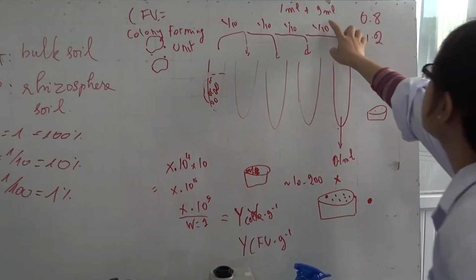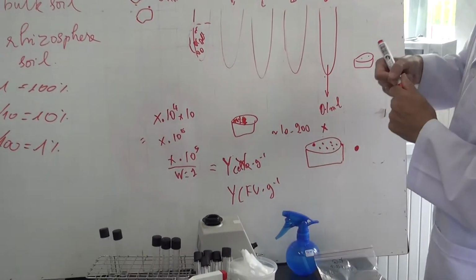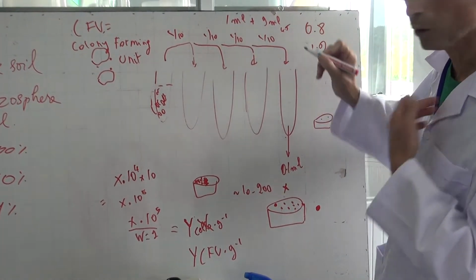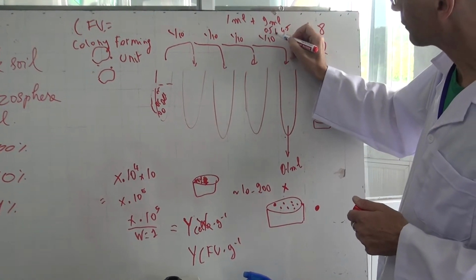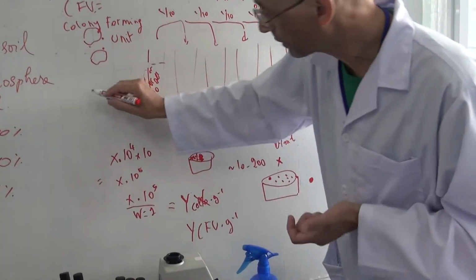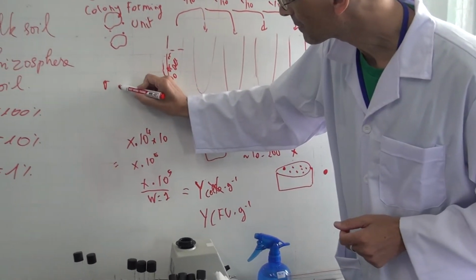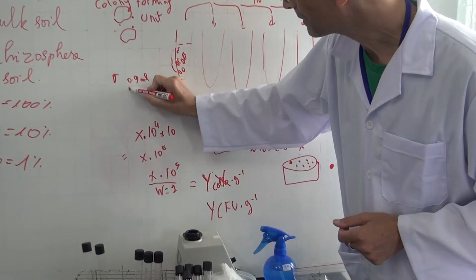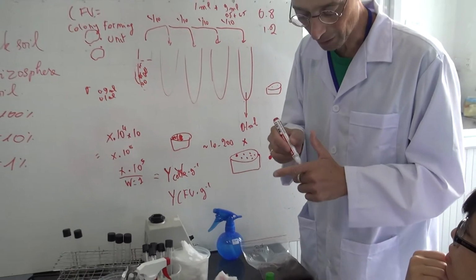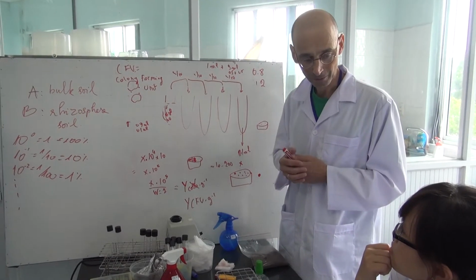Yeah? Yes. If it's not 9, it's 5. Okay, you can do whatever you want. If instead of 9, we often use 0.5 and 4.5 because then it's smaller. You can also, depends, sometimes we do in Eppendorf, small tubes. So we take 0.9 milliliter and 0.1 milliliter, it depends on the habit of your lab and how you're doing it, what is more convenient.